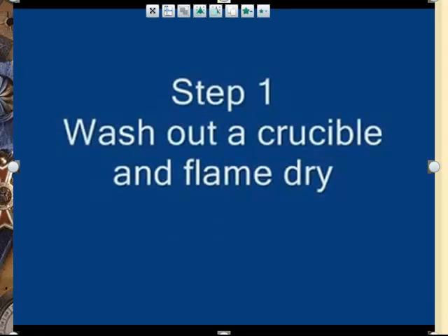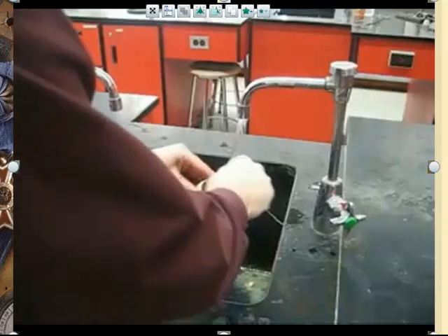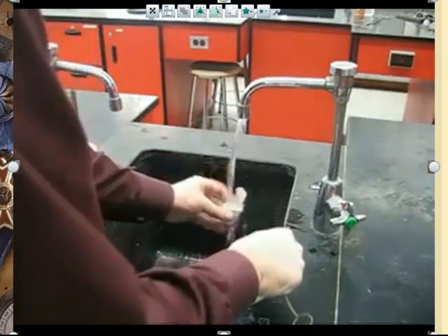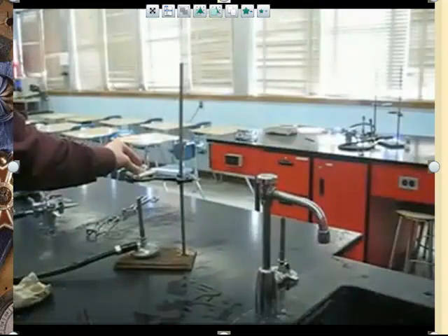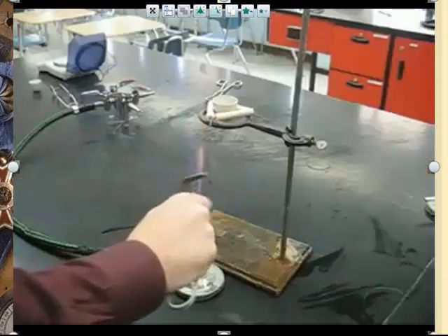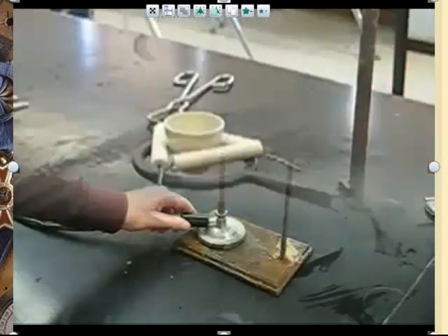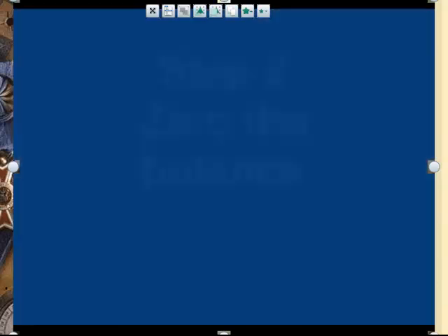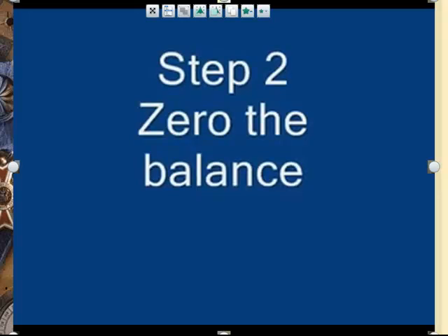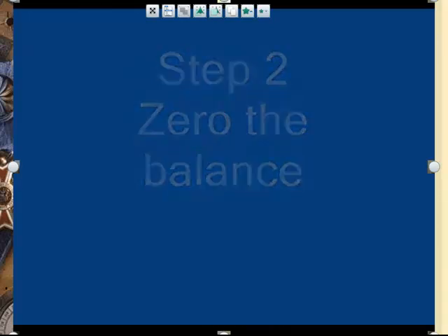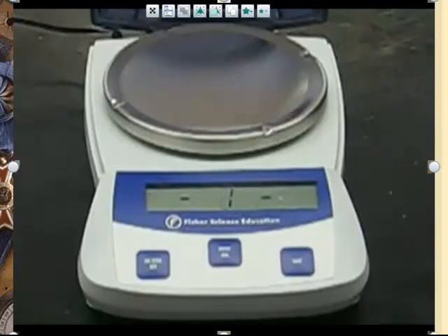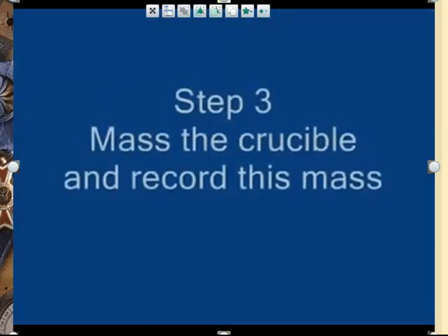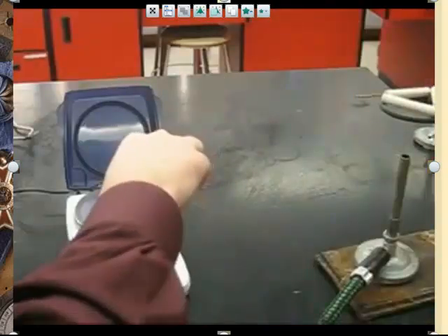And so what this teacher does here is they first clean the crucible, and so then you have to dry it because water's pretty heavy. So cleaned it out, heated the Bunsen burner, heated it up for a few minutes, get rid of the water, and then allow it to cool before you put it on the balance. Remember we talked about that in our lab, we do not pick something up and put it on the balance with the crucible tongs like happens here. We want to wait until it's cool enough that you can pick it up with your hands. Then it'll give us a proper mass, then we don't have to worry about messing up the balance, so we're going to pick it up by our hand, put it on there.